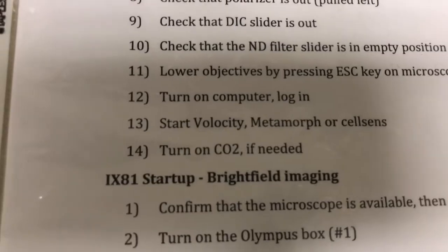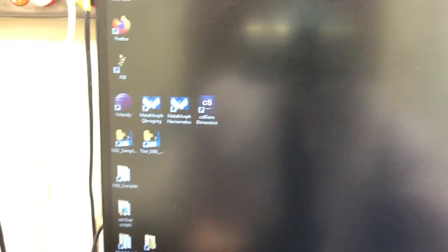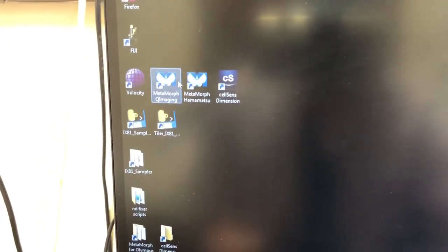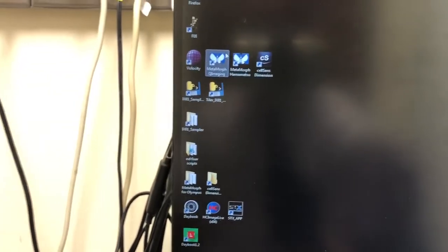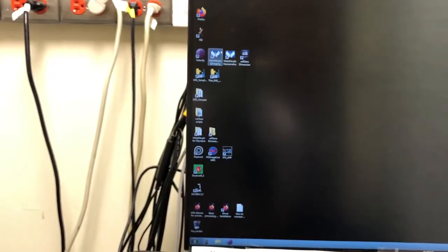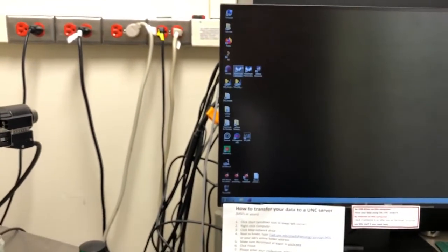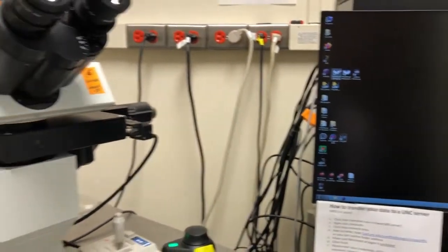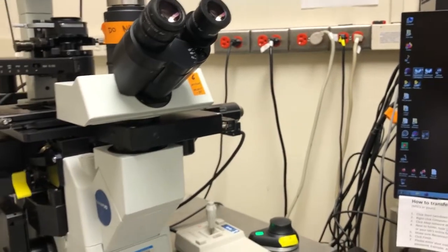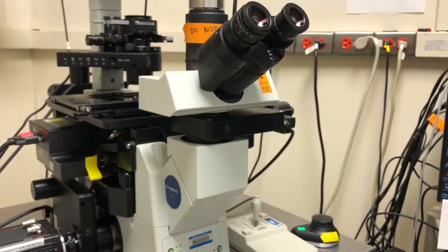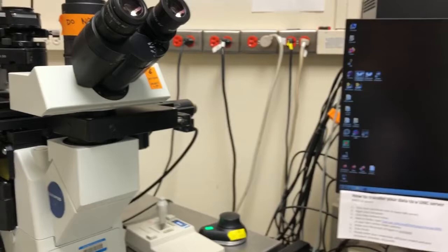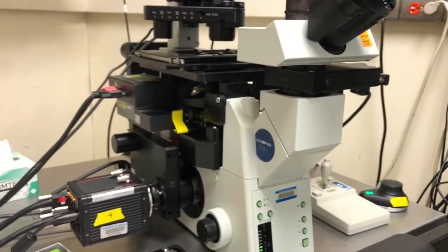And now we have to, if you look here, start velocity, metamorph, or cell sense. So that's what software you're going to use. And you're just going to double click here on whichever one you want and it will start. I will have different videos for people using metamorph and velocity. So depending on what you want to do, look at the correct video. And again, velocity, you should only use it if you're doing something very simple, like just multiple channel imaging. Just going to different positions and taking images in multiple channels. And if you've already been trained on the BX 61, because velocity is very similar to the software there. And so it'll be very easy for you to learn how to use this microscope. If you're a new user or if you're doing random sampling, if you're doing wide field deconvolution, if you think you'll need live imaging, in any of those situations, then you should use metamorph, which is much more powerful and flexible, to allow you to take images.